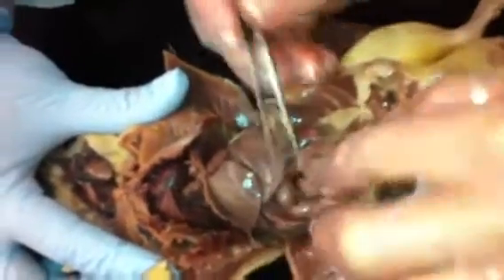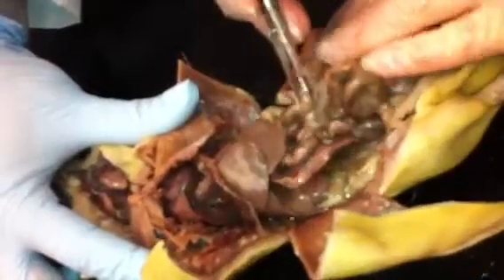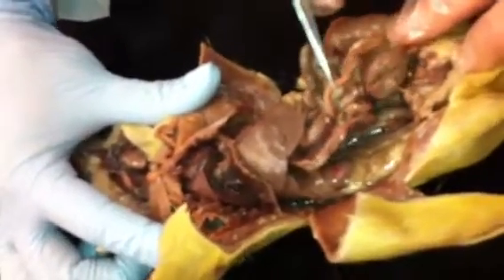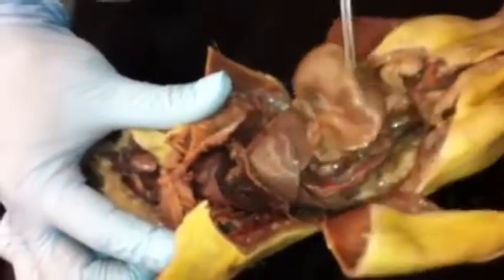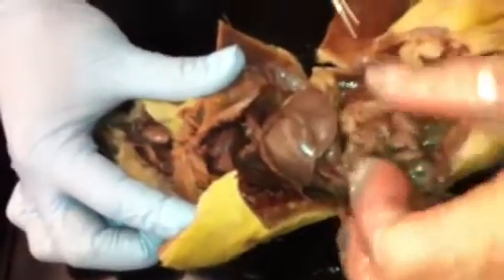So by identifying the rectum here and the large intestine, then we can actually kind of trace the large intestine around right there, and it gets a little small, but that's still part of the large intestine. And then gradually you can see that we lead to the cecum. So all of that's large intestine there.